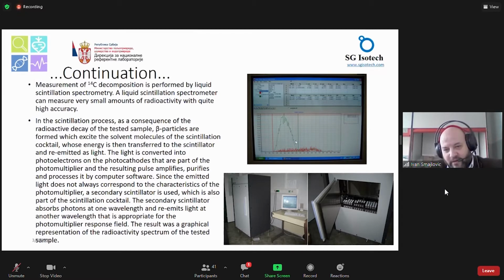So by taking different ratios of natural and synthetic ethanol, we can make actually a calibration curve. And this means that this peak will grow bigger and bigger until it is 100% natural. So we can make mixtures, 10% of natural ethanol plus 90% of synthetic, then 20, 80, 30, 70, and etc., up to 100% natural. So this means that this peak will slightly go up, and then when we calculate the surfaces of these peaks, we can get analytical values, and we can make a calibration curve for this. And according to this calibration curve, as any other analytical method, we can, in our sample, detect the amount of synthetic ethanol in a specific alcoholic beverage which is tested.